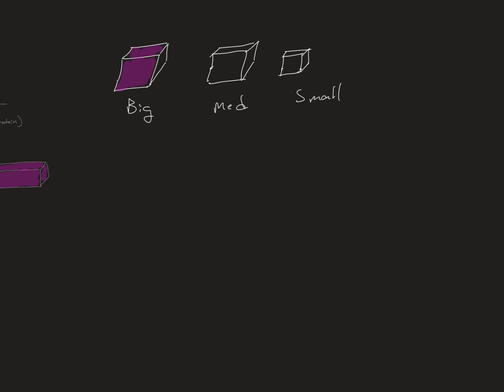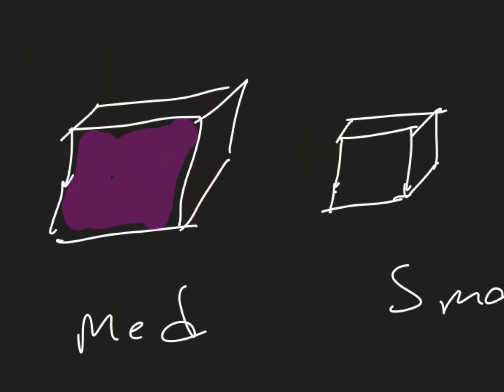So I know that it's basic. How do I know it's basic? Because it's pink. If it turns neutral or acidic, it's going to become clear. So the only way this is going to change color is if it becomes acidic, if you start to add hydrogen ions. So we have to add hydrogen ions if you want this to change to clear.